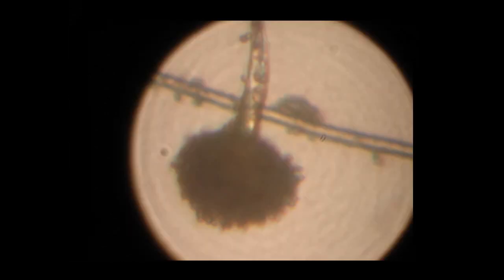These are individual eye cells from the compound's eyes. And I found a series of transparent cells not bound to any tissue underneath. So these are ideal examples for seeing how each of those individual eye cells are.